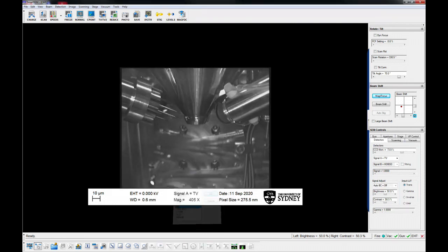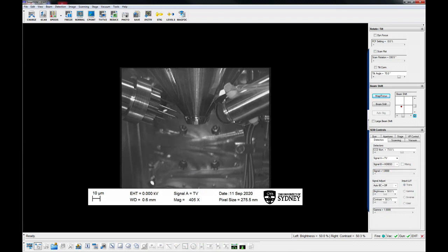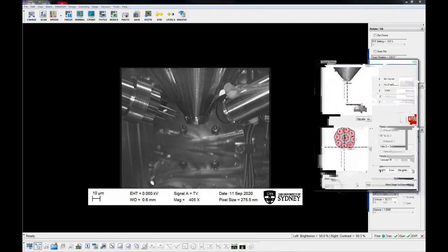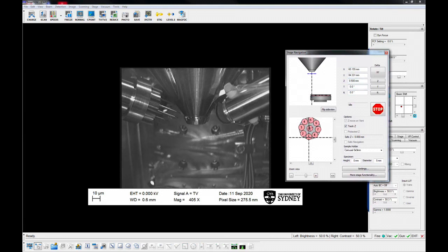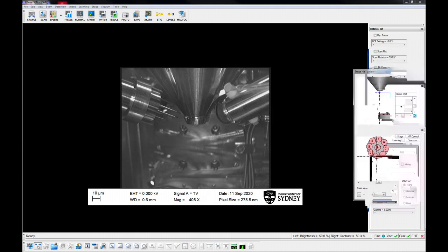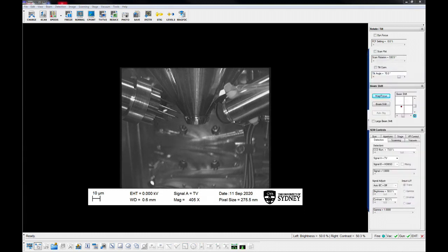The chamber should appear as it does on the screen currently. If it doesn't appear this way, check that the stem, EBSD, EDS and backscatter detectors are withdrawn. Check chamber view and the stage control panel, and move the stage to a safe position. Tilt to zero if needed.